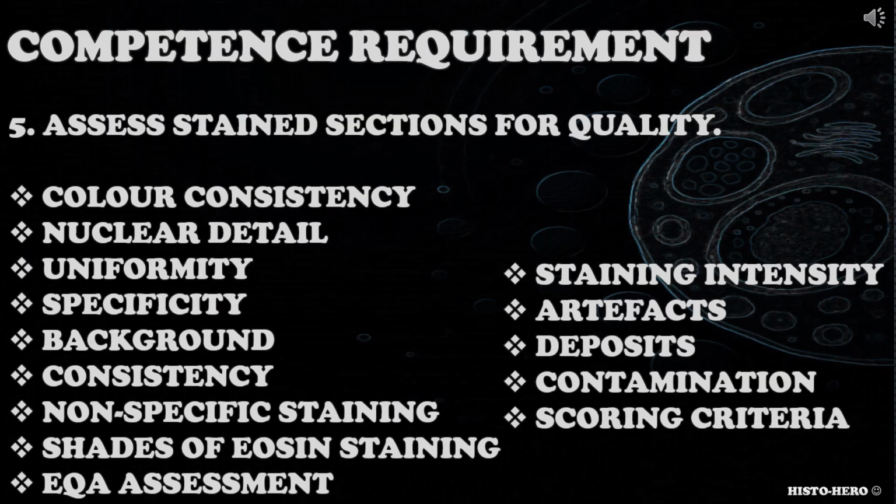When addressing this competence requirement, candidate could consider color consistency, nuclear detail, uniformity, specificity, presence of background, consistency of staining, presence of nonspecific staining, shades of eosin staining present, EQA assessment criteria.